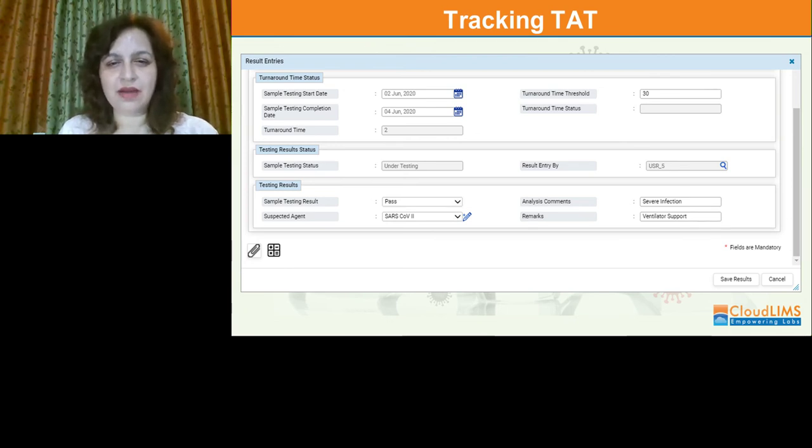The factors that can be affecting the TAT could be inadequate inventory, delayed approval processes, staff competency or training requirements, and these can be effectively addressed by the lab manager to bring the TAT within acceptable limits.